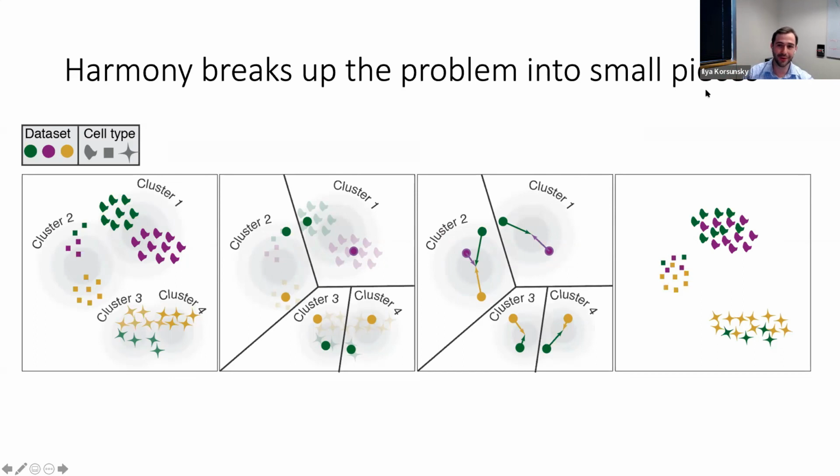That is definitely worth doing, right? Especially for spatial and single nucleus and single cells. Single nuclear a lot of times for some reason doesn't capture immune cells very well, and single cell obviously doesn't capture weirdly shaped cells like muscles and fibroblasts very well. So it's a great design strategy to use single nuclear and single cell and then combine them based on their shared cell types.